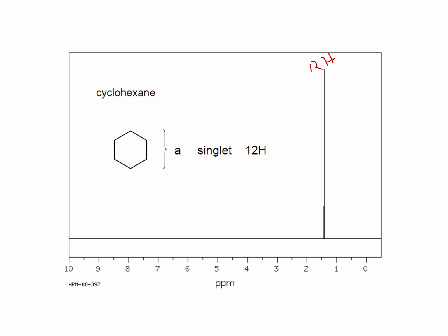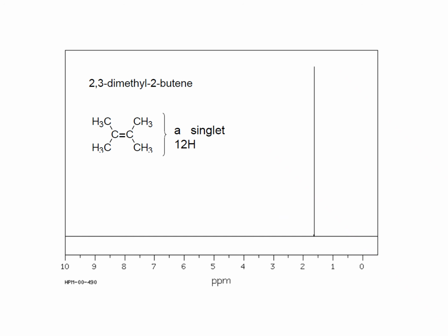If it were 3 hydrogen, then its height would be like that, 2 hydrogen would be like that, but it has 12 hydrogen, so it's a very sharp peak. Okay, then singlet, so no splitting occurs. And also see its position. Its position is very near to 1 because there is no heteroatom, only carbon and hydrogen, so its position is 1 to 2.